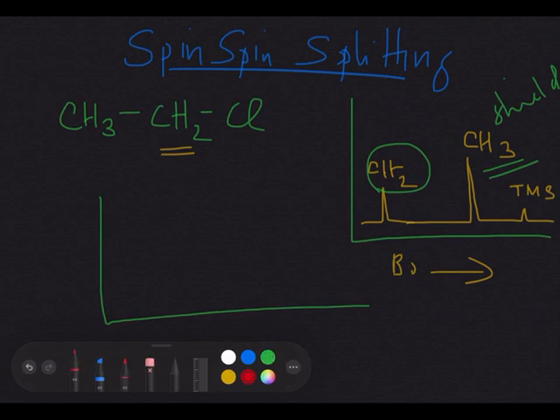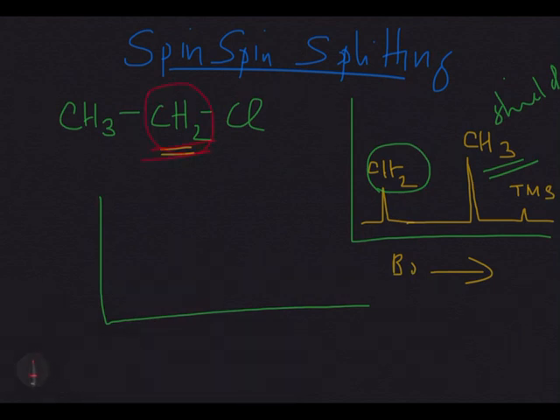here the first signal is of CH2. The CH2 protons generate a magnetic field because protons are charged particles. Similarly, CH3 protons also generate a magnetic field. So there is interaction between the magnetic fields of these two sets of protons and the external magnetic field. Because of the lateral interaction of the magnetic fields of the two sets of protons, there is splitting of each signal.